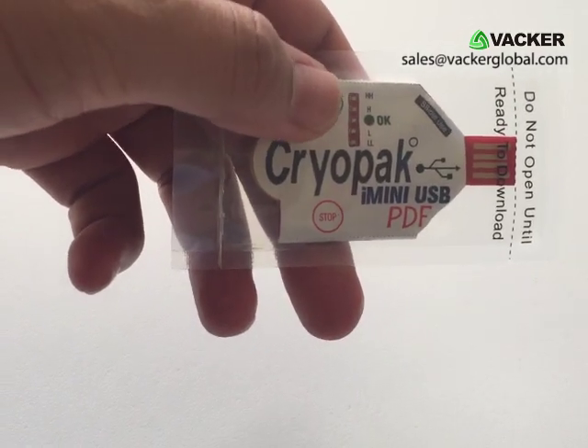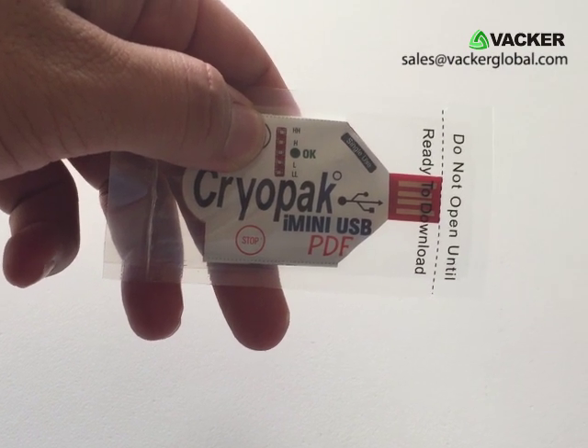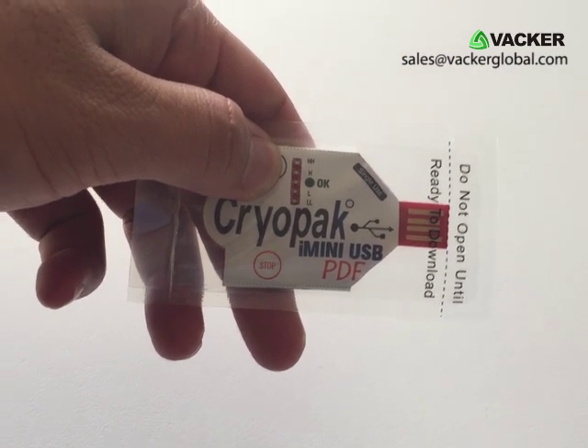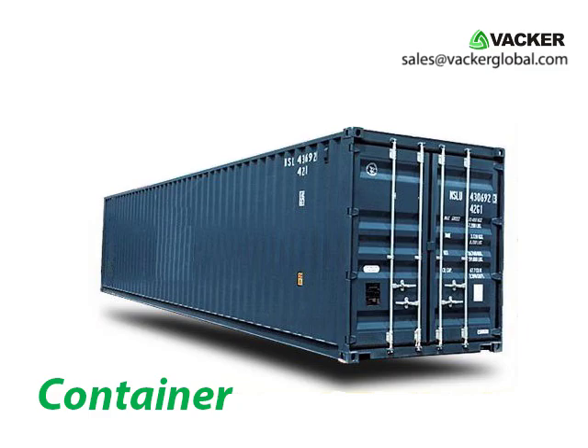In order to start recording, you have to press the start button for a couple of seconds until all the LED indicators start blinking in quick succession. Now the USB logger has started recording. You can now place the data logger inside the box which contains the items.